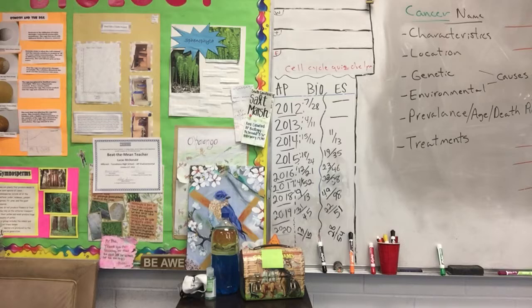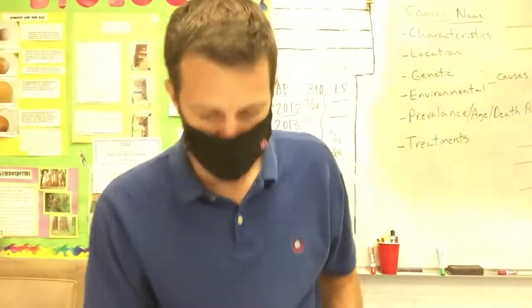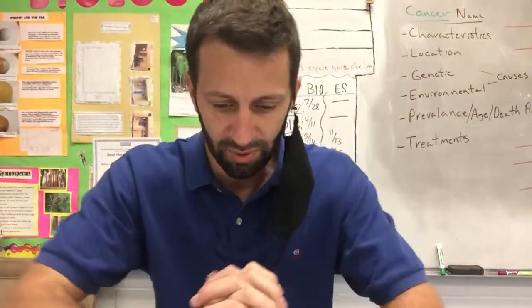Yeah, and so this is probably a little bit easier to see right here though. So you're just coming together where, let's say 50, come this way, 10, come this way, and then 40 this way. So wherever those three lines intersect from the three different sides, you should be pinpointing about there. Does that make sense? And so what do we get, Caleb? Sandy clay.